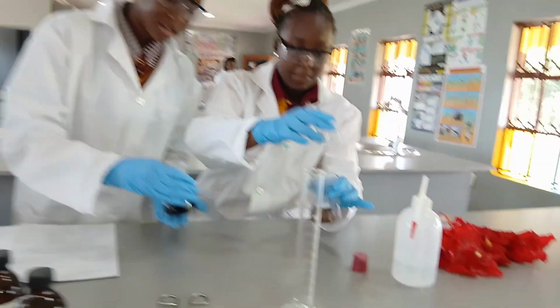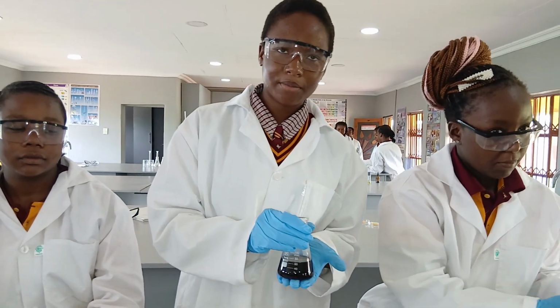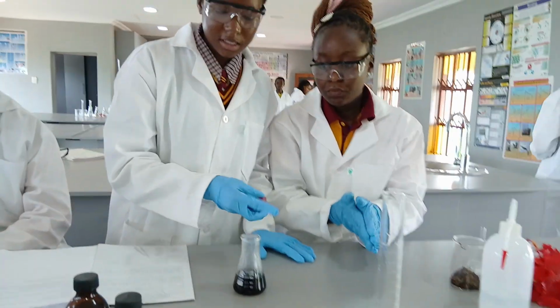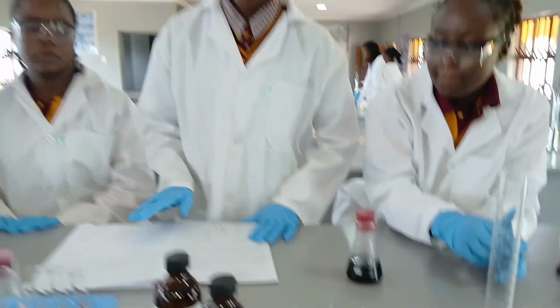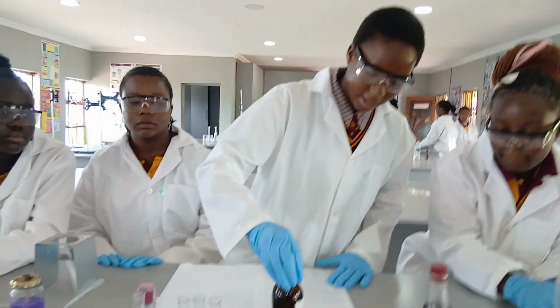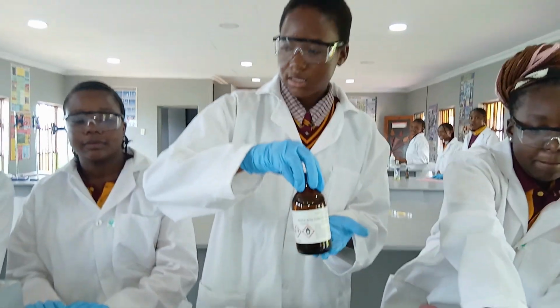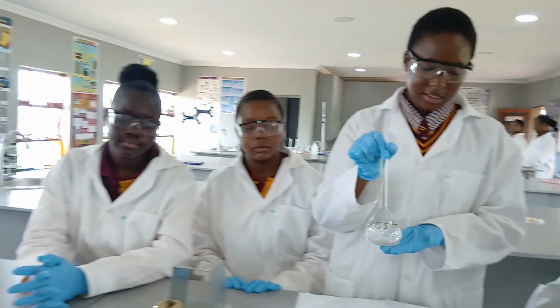And then this is our hibiscus flower indicator that my group members and I have prepared. Now we're going to test and see if it's really going to work using some of the solutions that we have, which are ammonium hydroxide, acetic acid, and our hydrochloric acid.